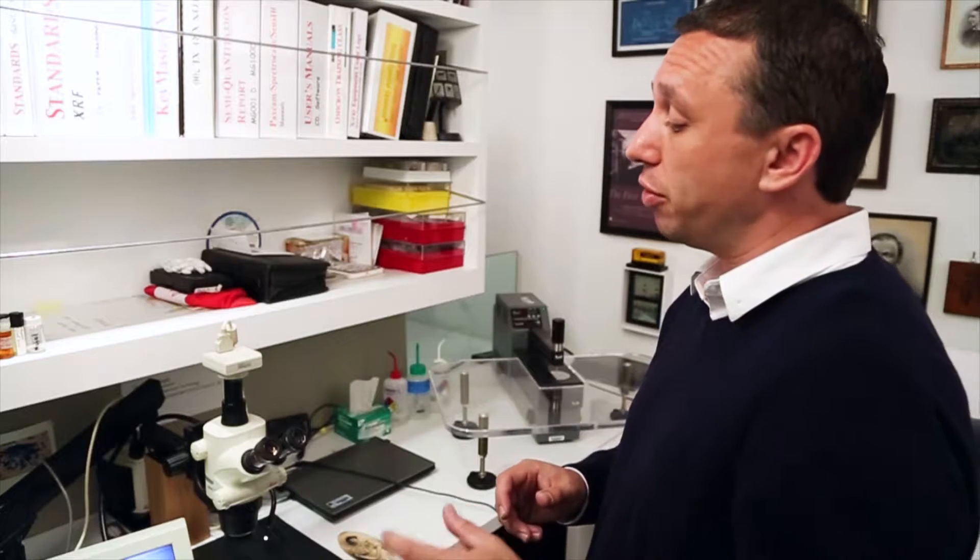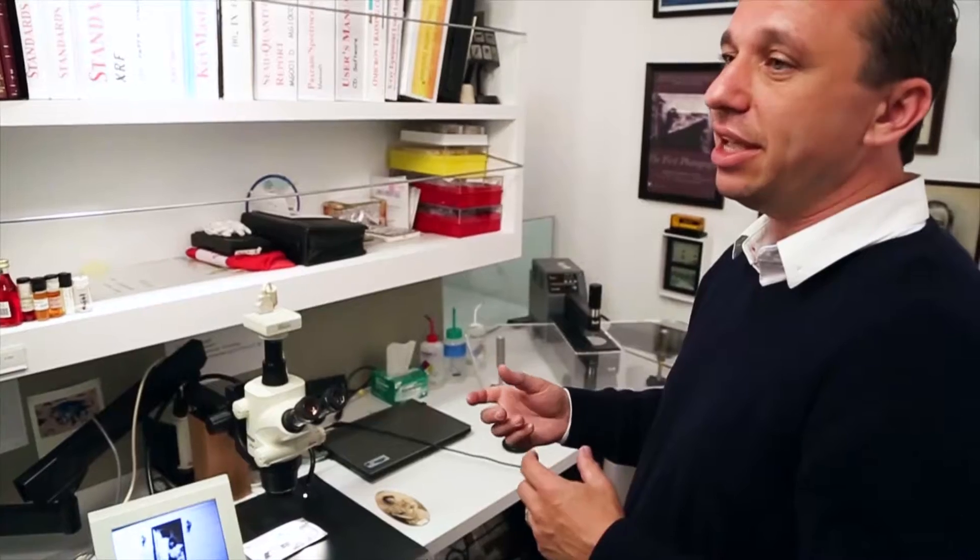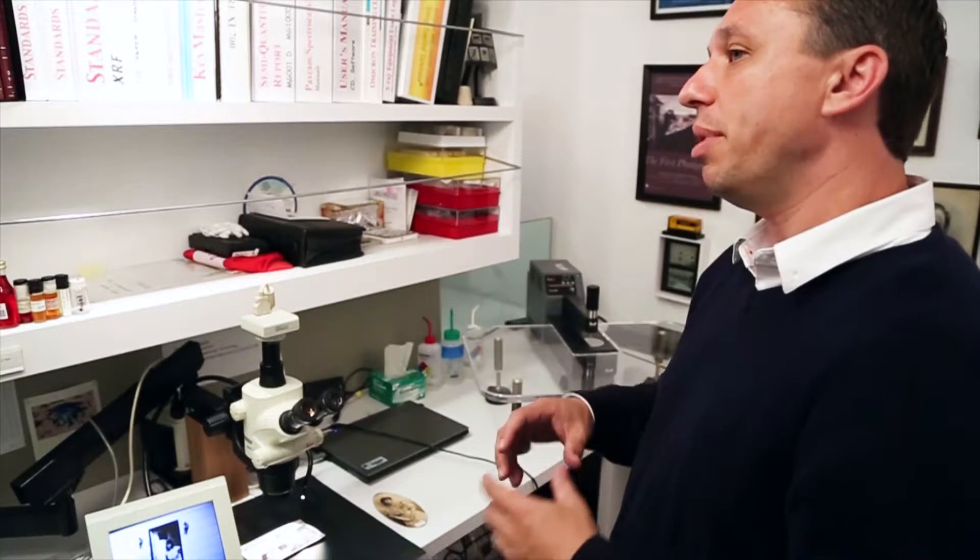So what we're seeing here is part of the analytical signature. It shows us how many layers are present in the photograph and it also can give us some information on the structure of the image itself — whether it was made photographically or photo-mechanically or maybe by some other means.